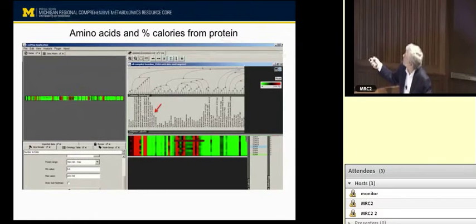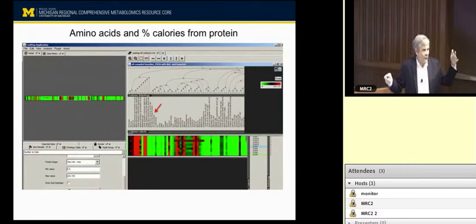And if we look at the percent grams of protein, even though they really didn't change at all from a statistical standpoint between the different diets, if you look at the correlation of the percent protein in the diet, it's in a cluster with all the amino acids. So now you can start exploring the data a little bit more, saying that maybe one number has not changed relative to the other, but the correlations between intake and the amounts are there under a specific dietary condition.